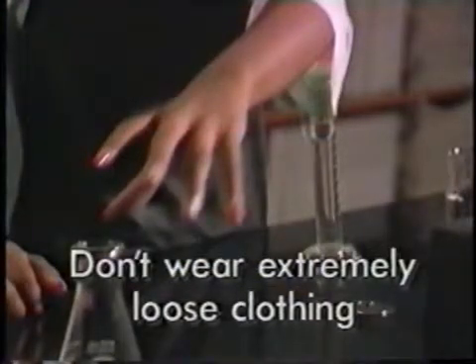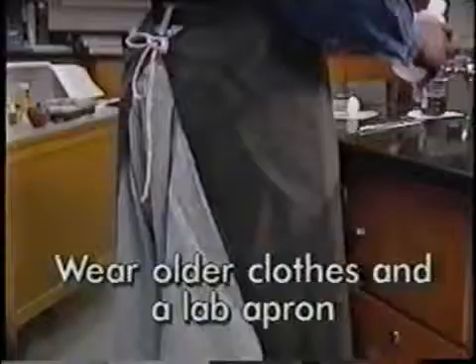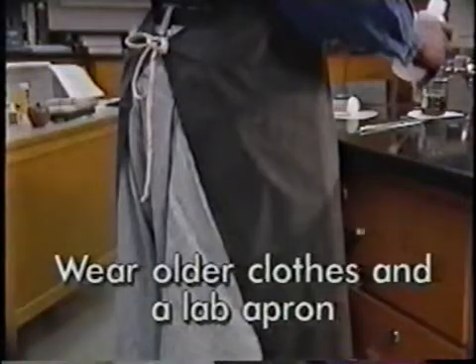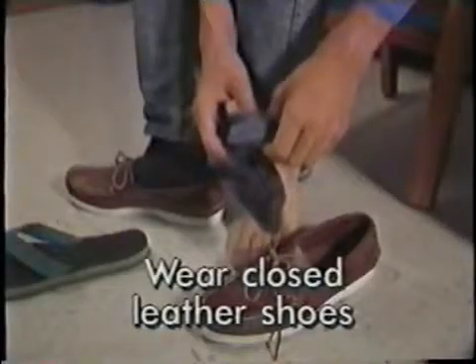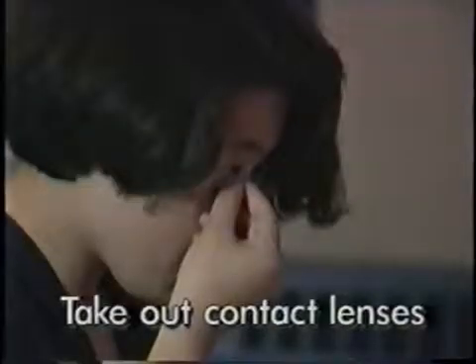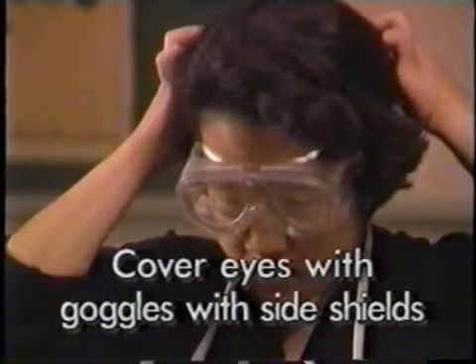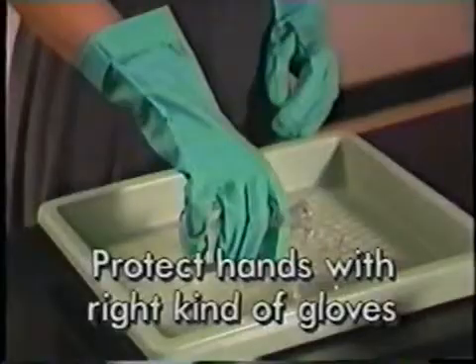Summary: Don't wear extremely loose clothing; fabrics should be sturdy and natural. Wear older clothes and cover them with a lab apron. Wear long pants or a long skirt to cover your legs. Wear closed leather shoes to protect your feet. Tie up long hair, remove rings and watches, and take out contact lenses. Cover your eyes with goggles with side shields, and protect your hands with the right kind of gloves.